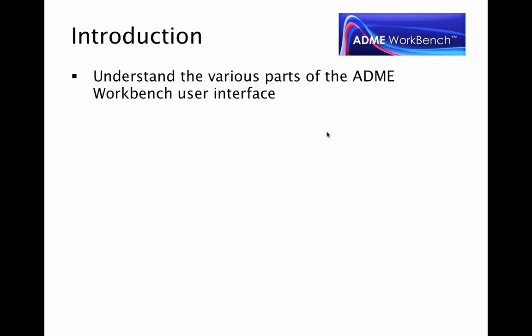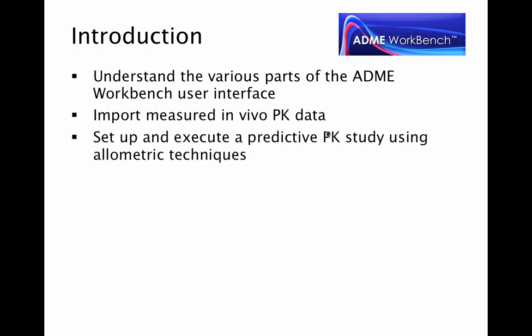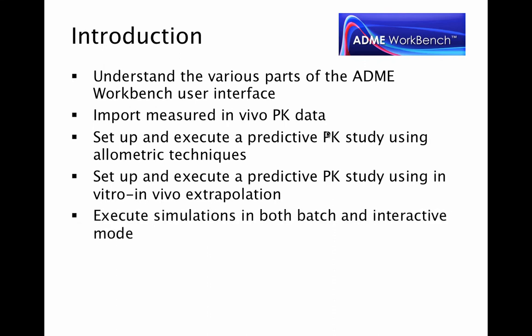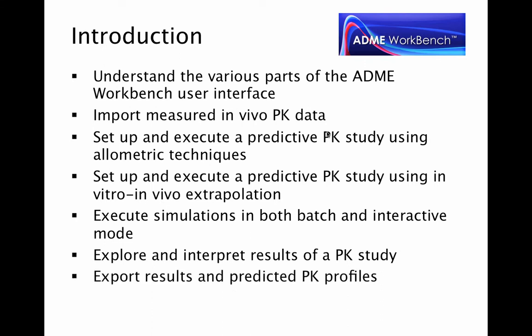At the conclusion of this series of videos, you should be able to understand the various parts of the ADME WorkBench user interface, import measured in vivo pharmacokinetic data, set up and execute a predictive PK study using allometric techniques, set up and execute a predictive PK study using in vitro and vivo extrapolation, execute simulations in both batch and interactive mode, explore and interpret results of a PK study, export results and predicted PK profiles.